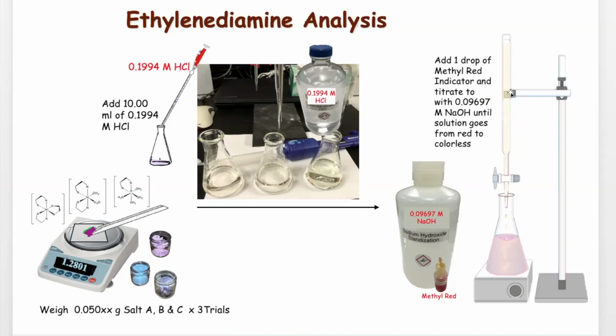If you know the volume of hydroxide and the concentration of hydroxide, then you can calculate the moles of the hydroxide. From here, you know that you have the concentration of hydrochloric acid and the volume of hydrochloric acid. So you can calculate the excess or the amount of hydrochloric acid that you react.